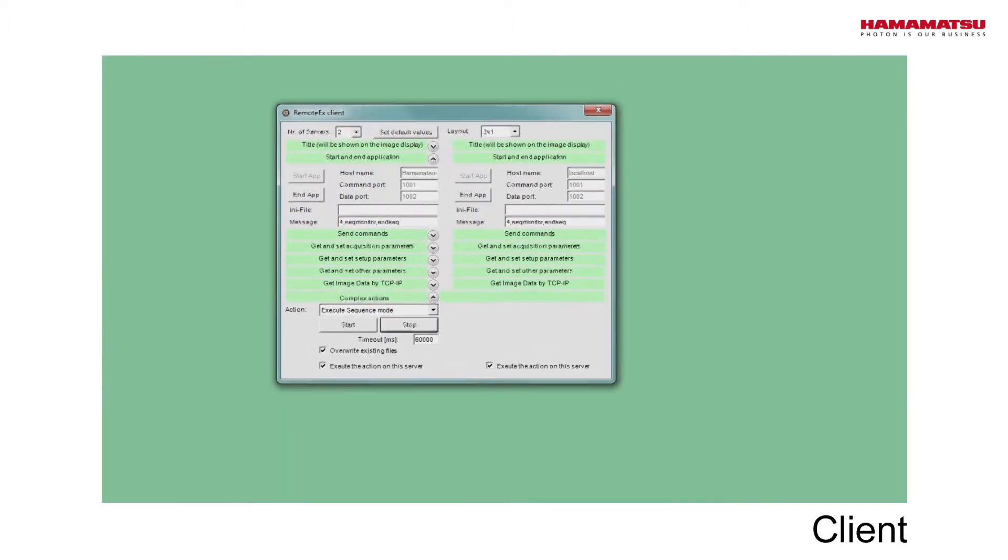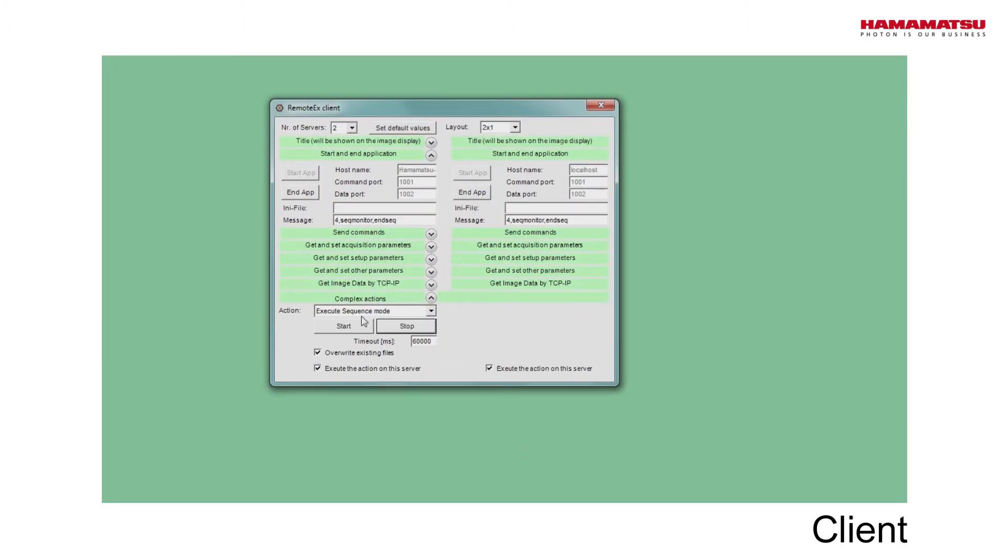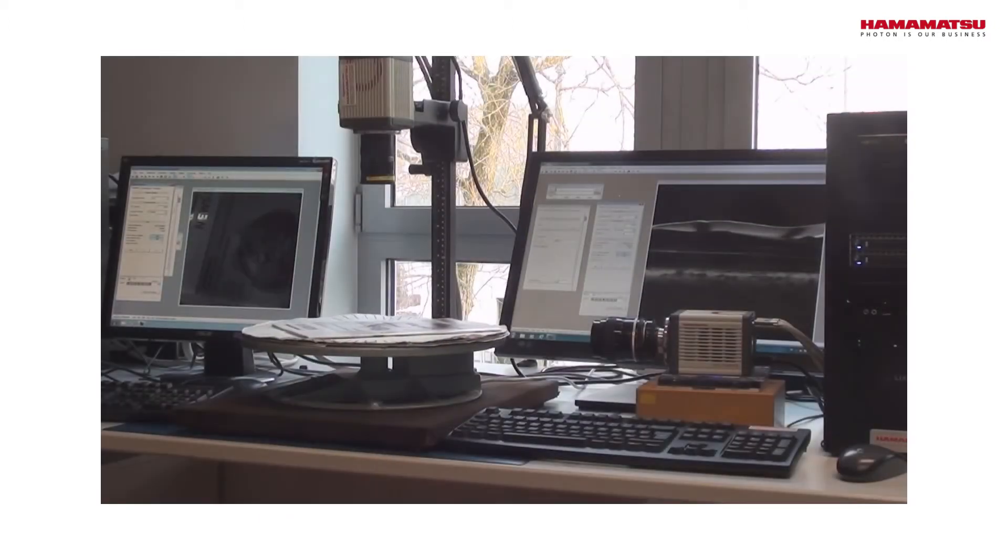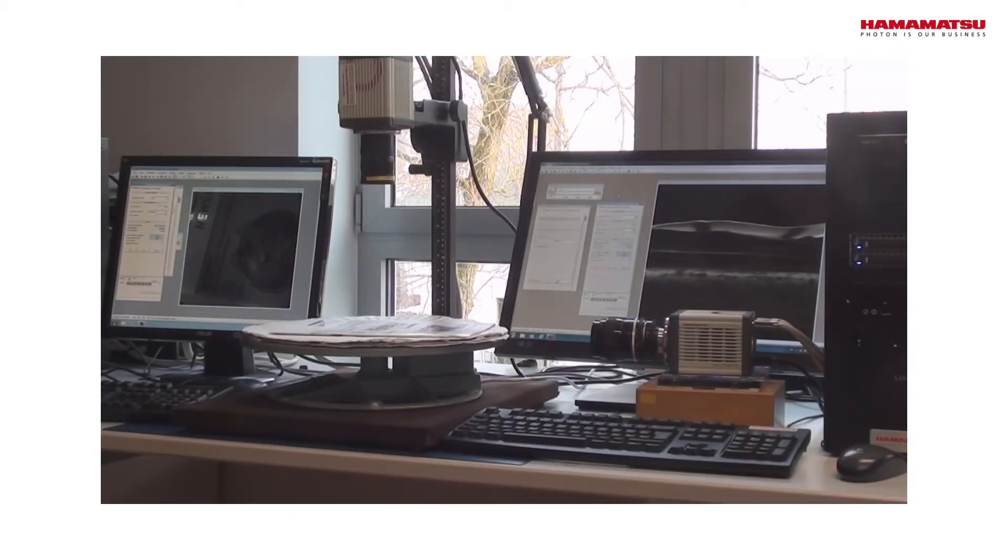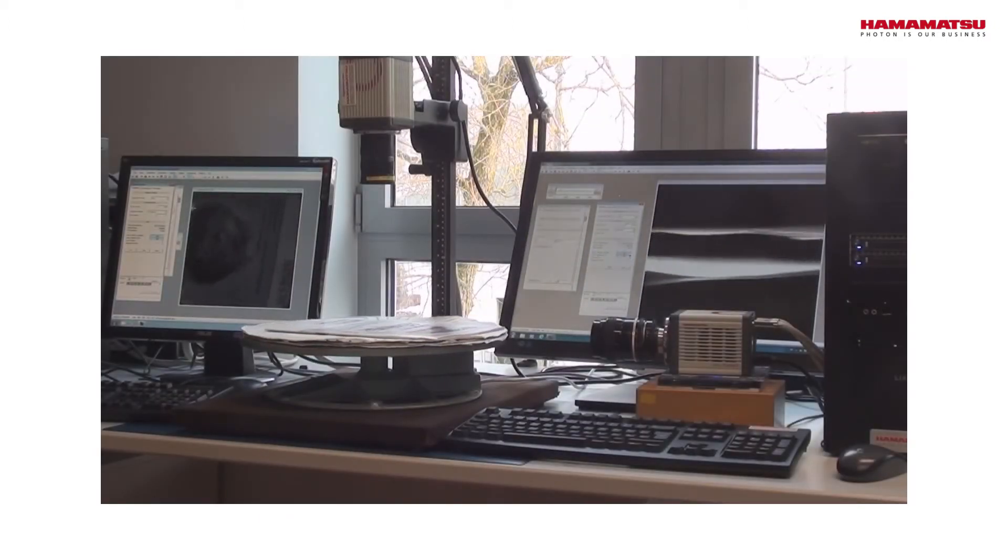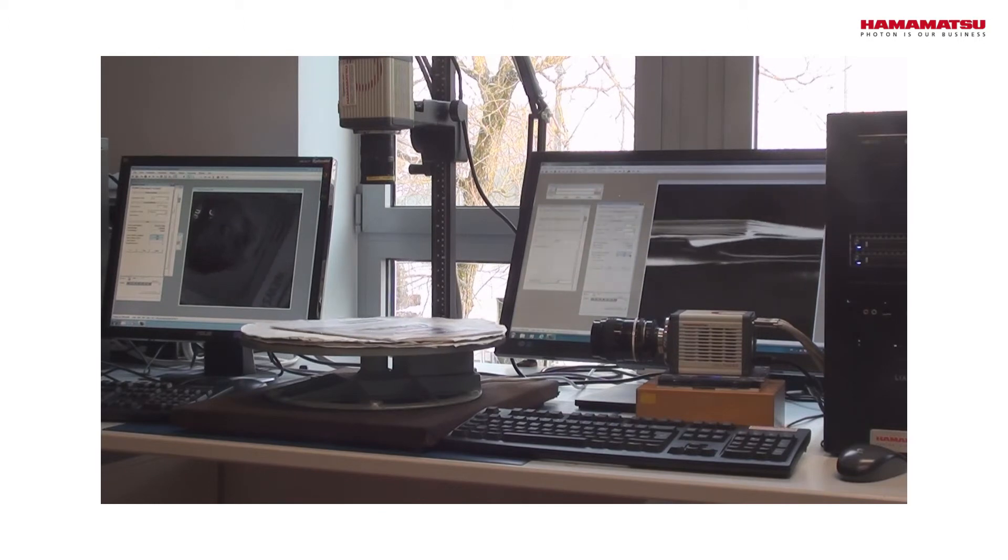We use the client to start data acquisition on every server. For this, we select Execute Sequence Mode and click Start.